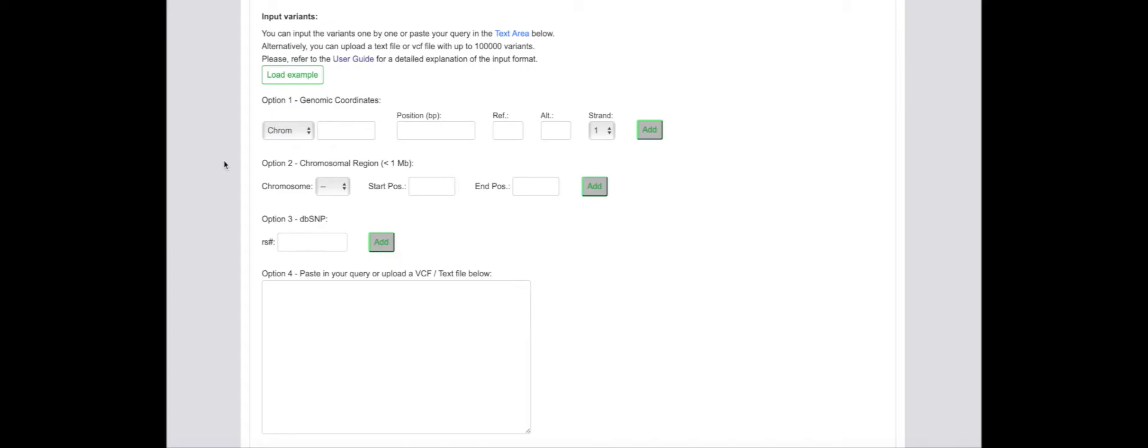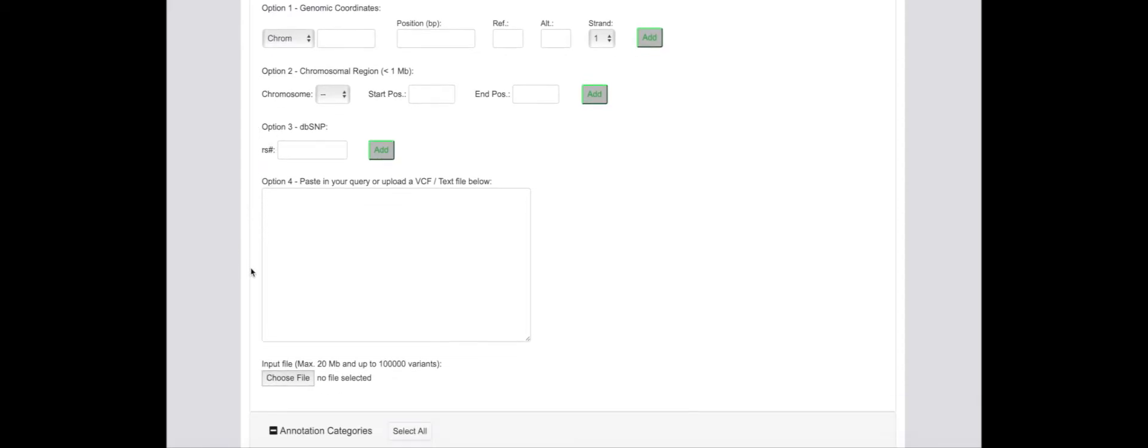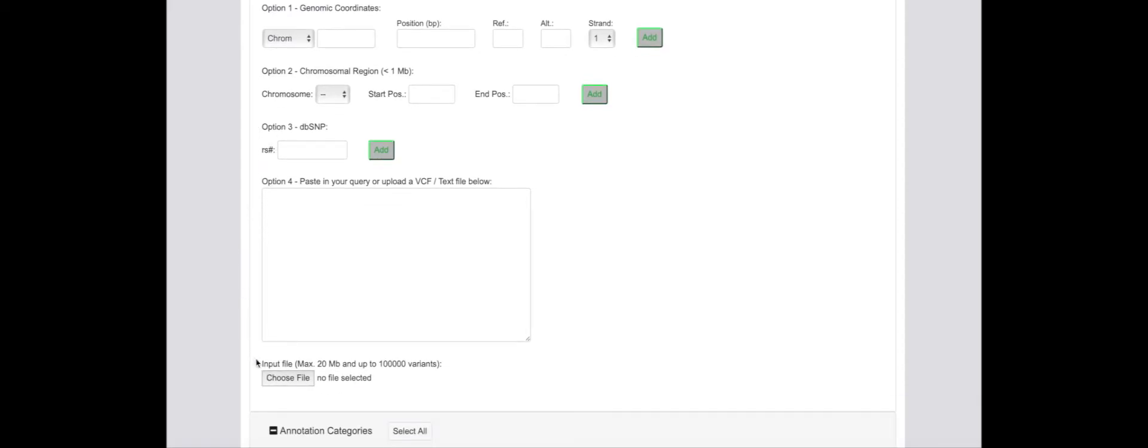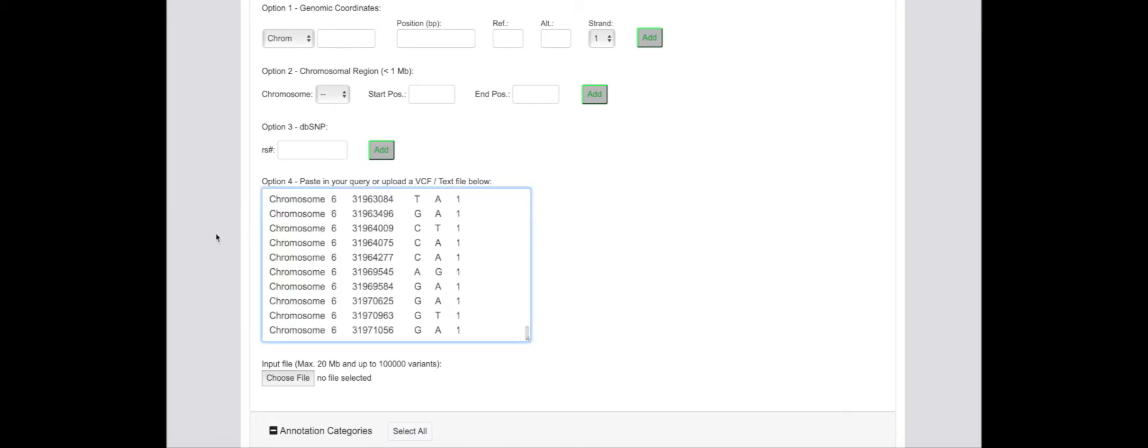Input variants, which can either be single nucleotide variants or insertions or deletions, can then be provided in one of several compatible formats. These formats are explained in more detail in the online user guide. Appropriately formatted input variants can then be uploaded or the queries pasted into the web interface.